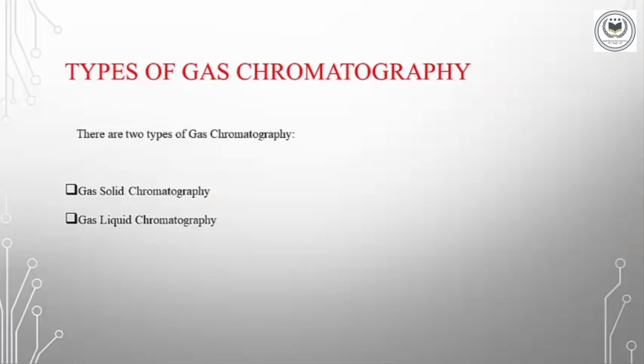Types of gas chromatography. There are two types of gas chromatography. First is gas-liquid chromatography and second is gas-solid chromatography.